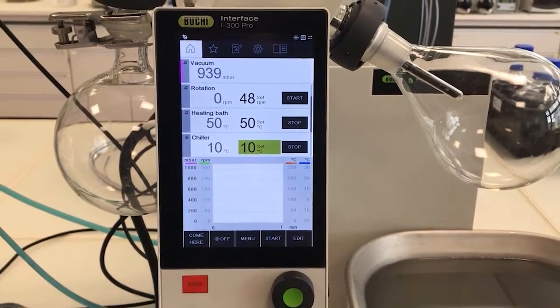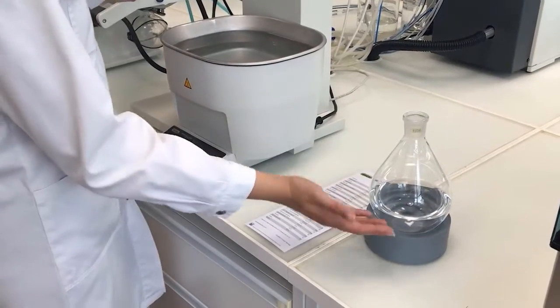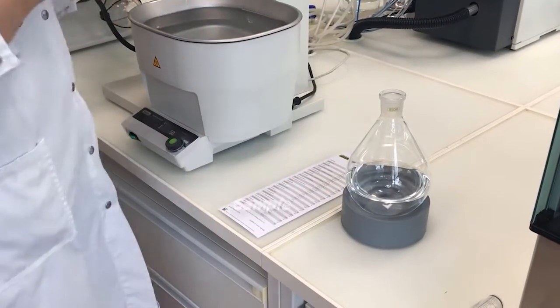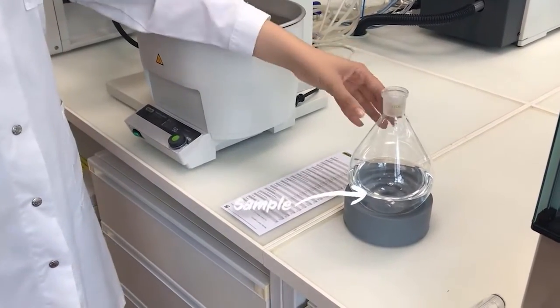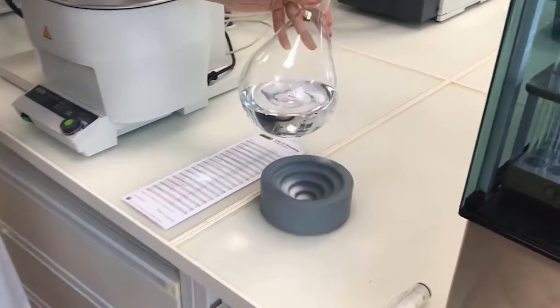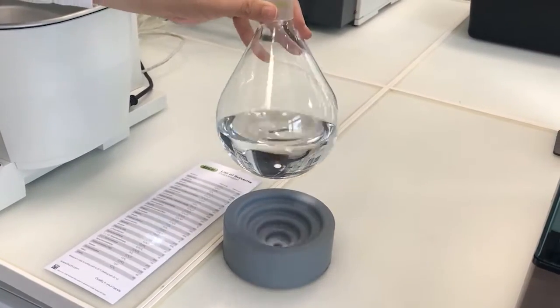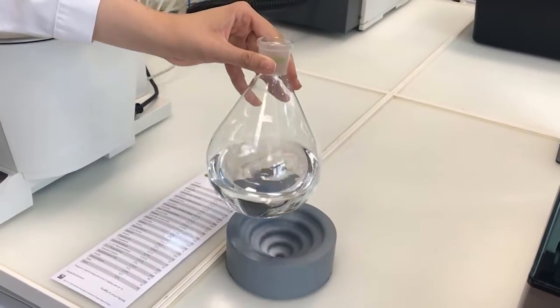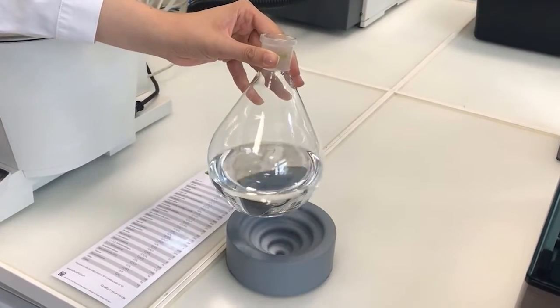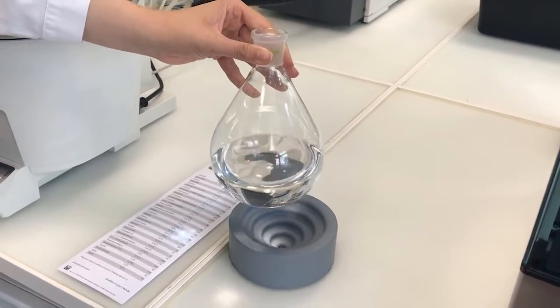Now let's get to the sample. Here is our flask with the sample. We filled the 1 liter evaporating flask to half of its volume. The bigger the flask the better, since the surface area will be bigger.